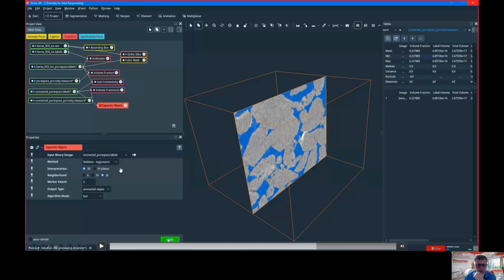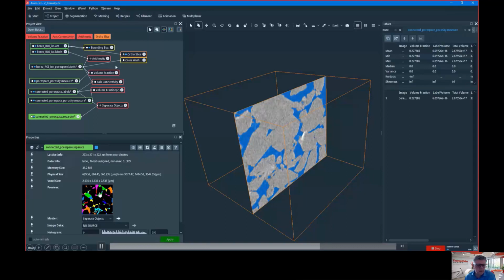So there are plenty of tiny details that you may want to set up here. And we can do this also in 2D. So if you have a 2D SEM with the pores, we can split them as well. The algorithm is a block that contains many sub-algorithms. So you see it took some time, but finally you get them split. So again, I connect, and this is my split pore space.